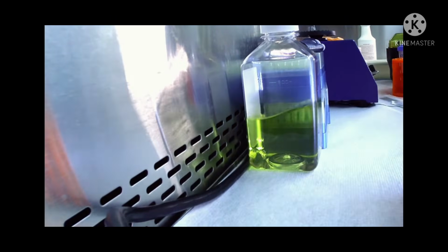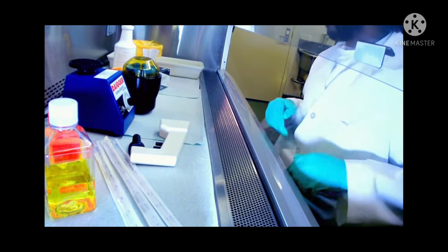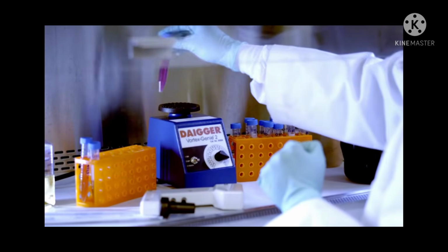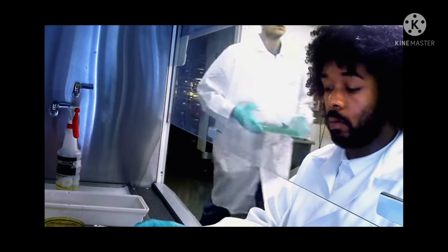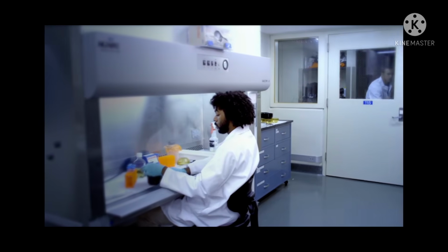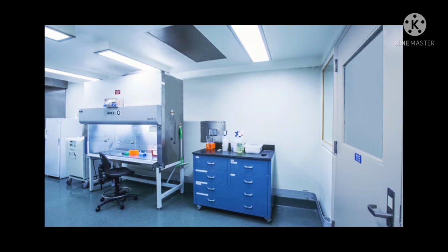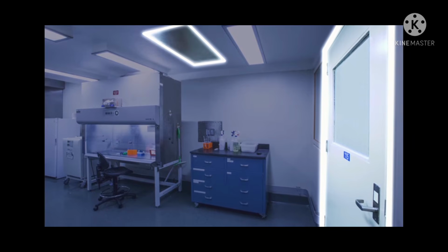Overcrowding the BSC can block air grills. Airflow can also be disrupted by sudden or sweeping movements. Slow, direct movements work best. Too much foot traffic can cause problems as well, and should be kept at a minimum. If pedestrians are unavoidable, keep people at least 1 meter from your BSC. And remember to check nearby doors or supply vents to determine if they disrupt the cabinet's airflow.